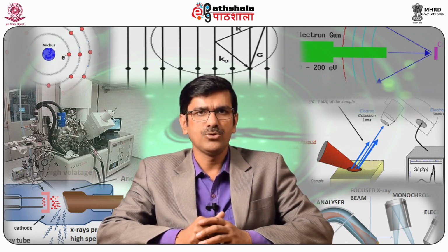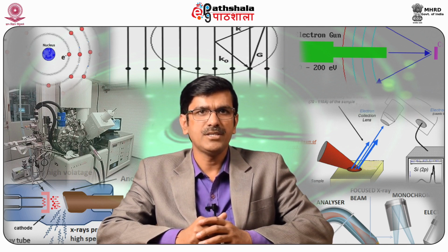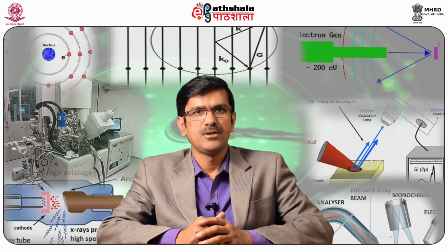Electrons that go to the detector without any energy loss show a characteristic peak called the photoelectron peak. Electrons that go to the detector with some energy loss show the XPS background called the inelastic peak. The binding energy scale is considered. Both conducting and non-conducting samples can be analyzed.